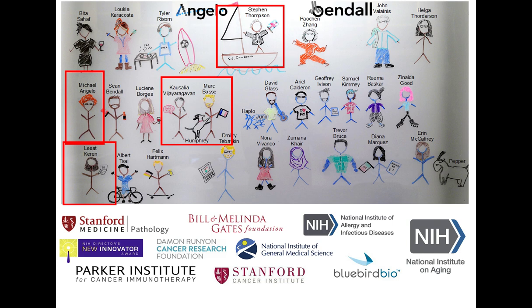For the higher resolution scans we showed near the end, looking at the dentate gyrus, scanning at about 250 nanometer resolution, because the ion dose is much smaller and we're sputtering less material off the slide, we tend to dwell longer with each pixel. On top of that, we're making more pixels because of the higher resolution image.